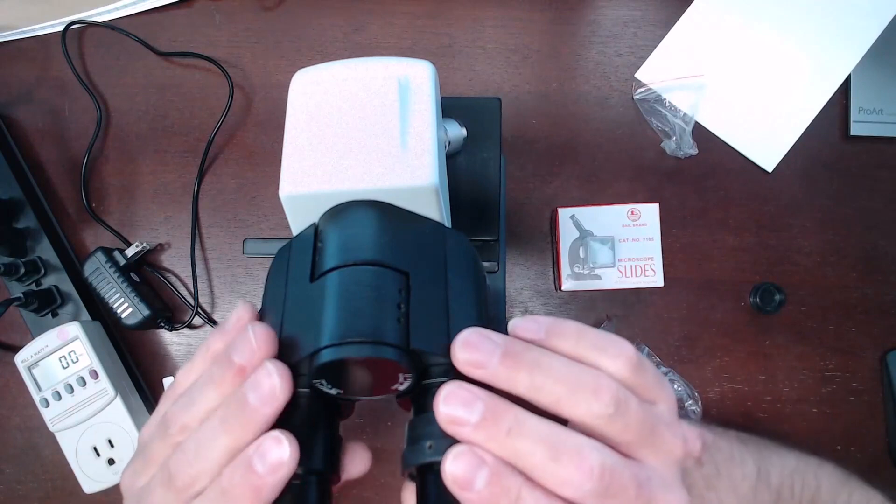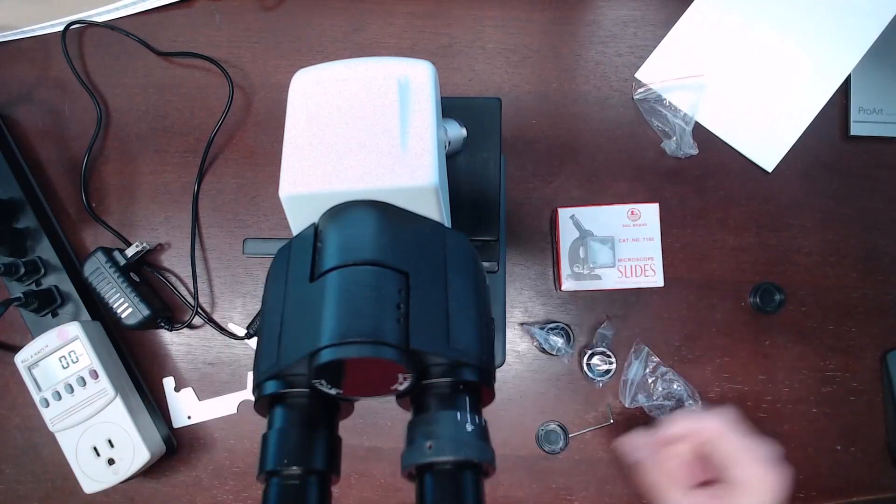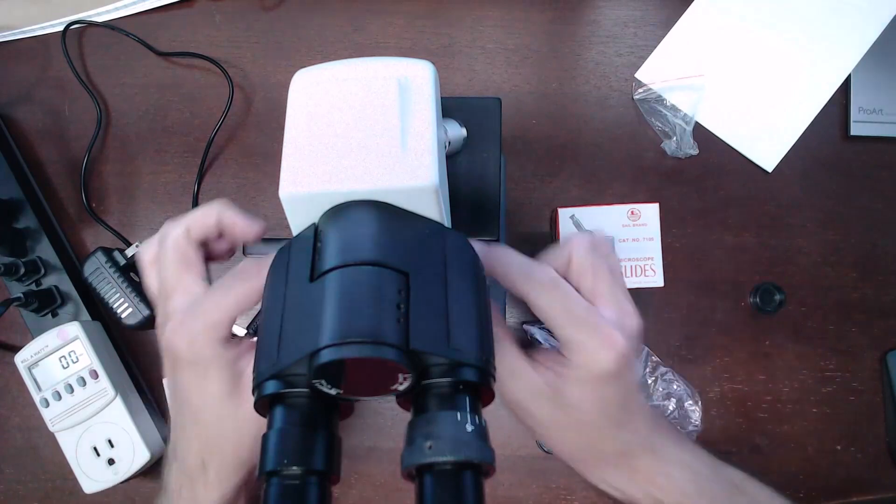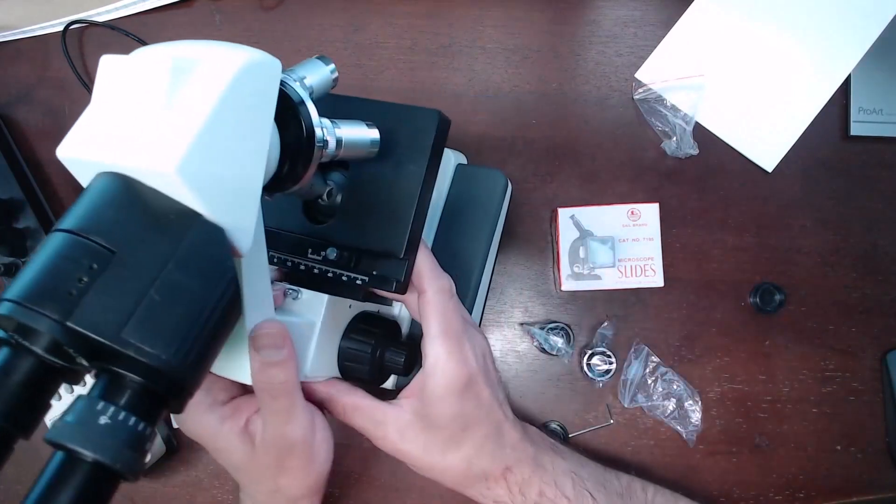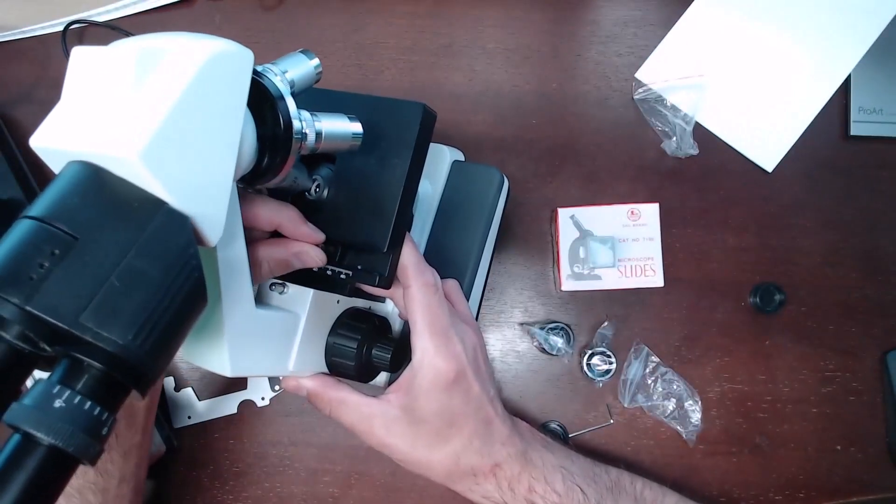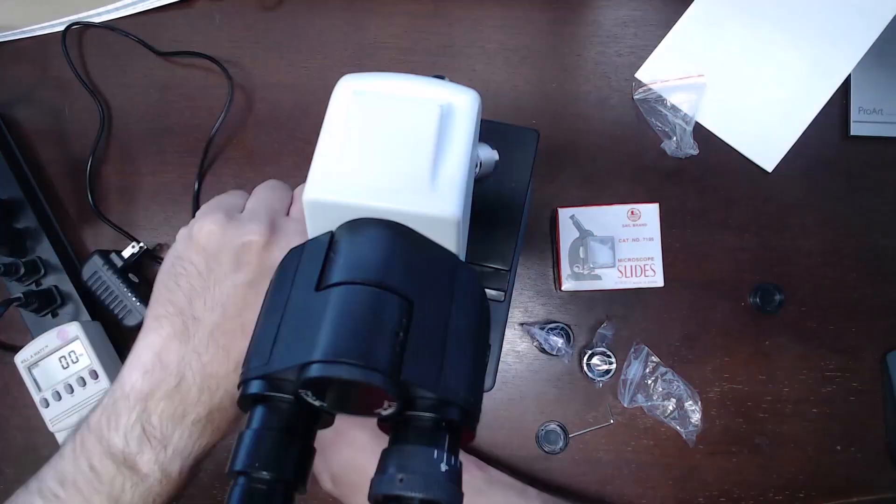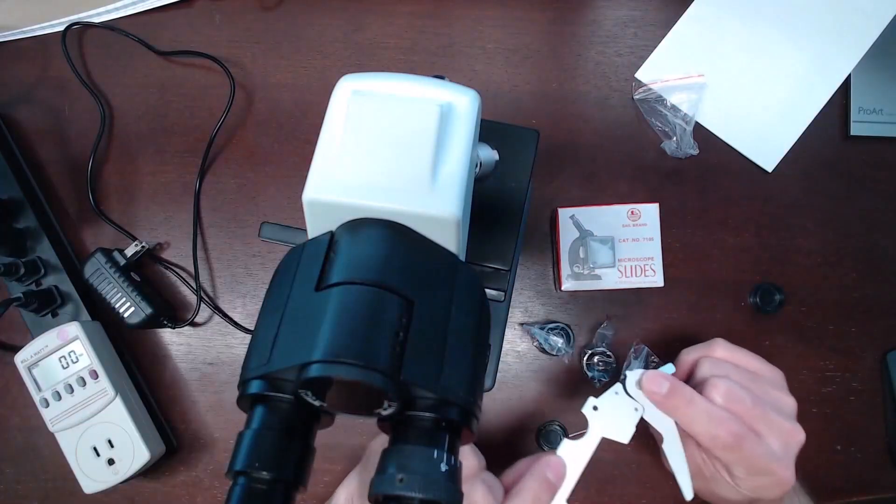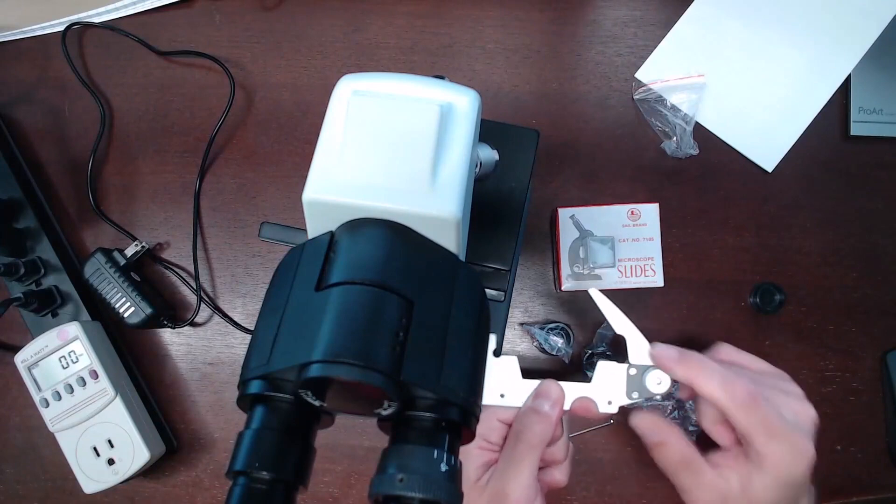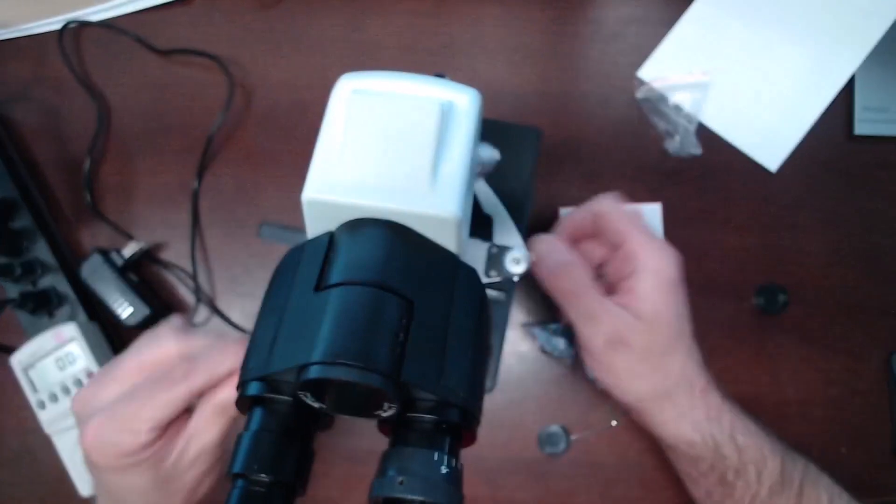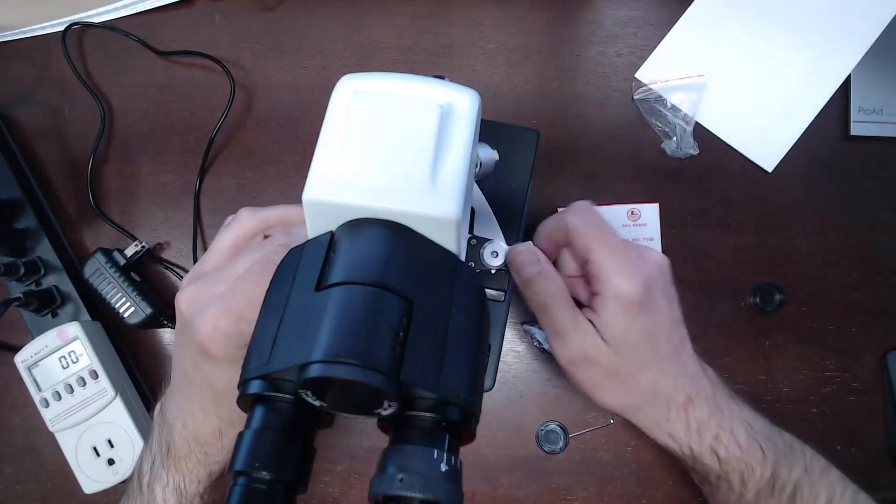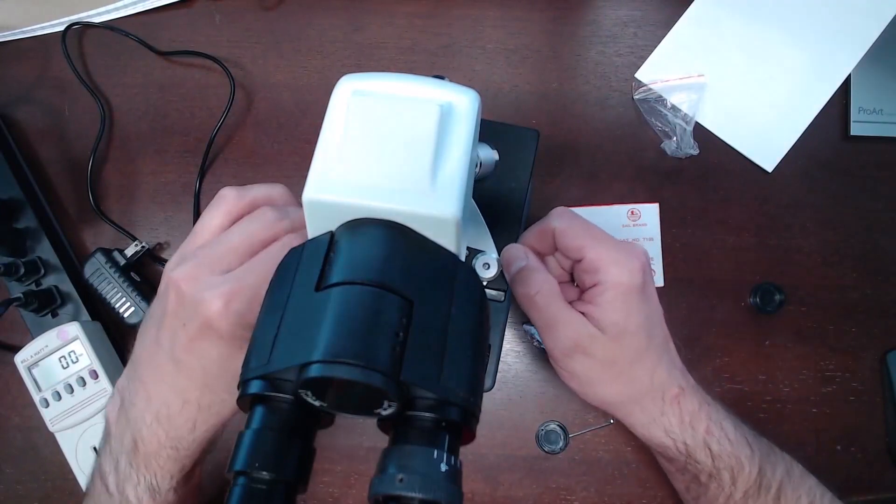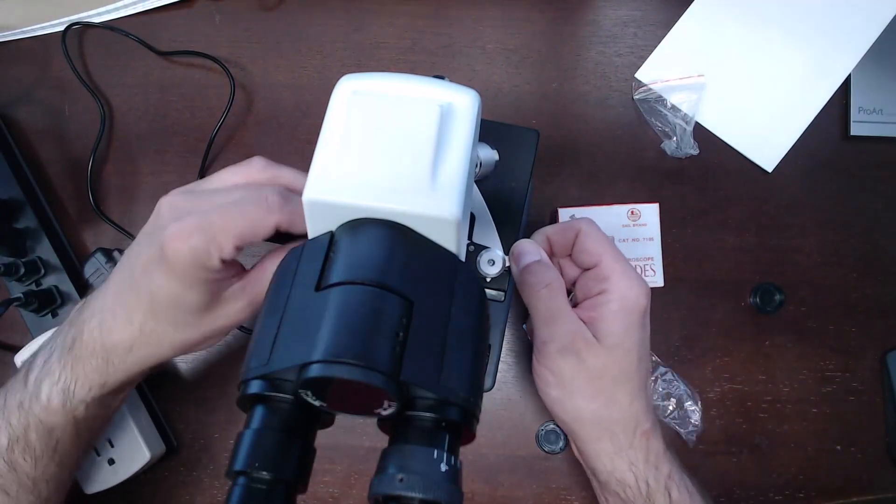We then remove the thumbscrews on the stage. There are these thumbscrews right here on the stage. We are going to then take the slide holder and there is an upside to this. It is pretty obvious. We are going to load this onto the stage and tighten it down with the screws that we just removed.